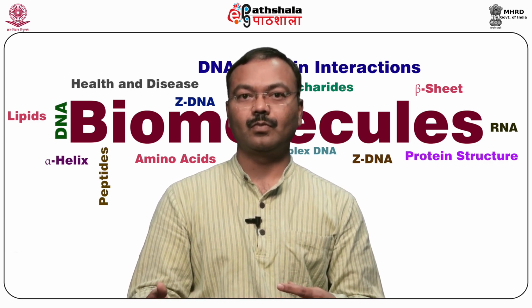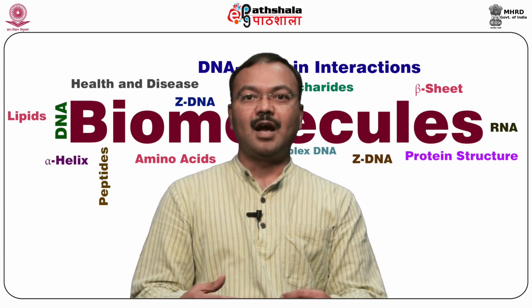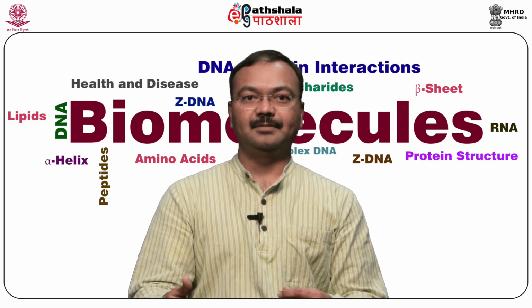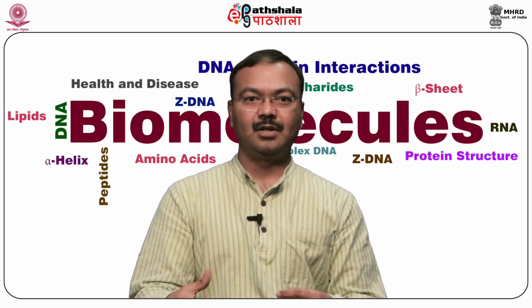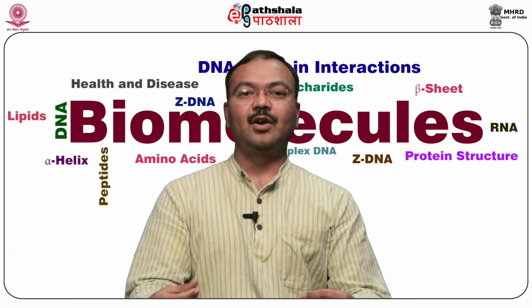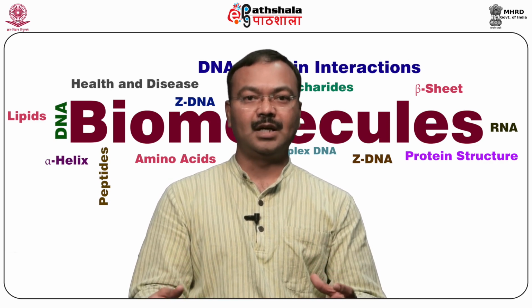Using the diffracted reflections and phase information, one could calculate the electron density. And from the electron density, a structure model is built into the electron density. Once the structure model is there, finally you validate the accuracy of the model.